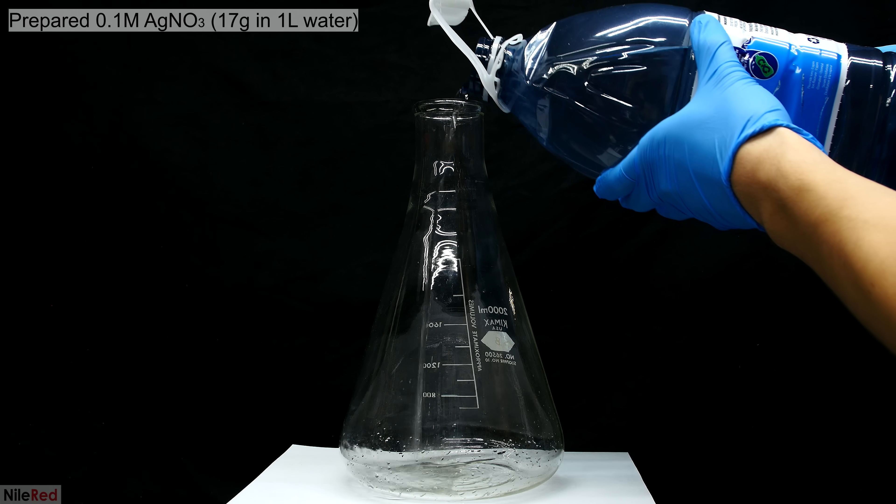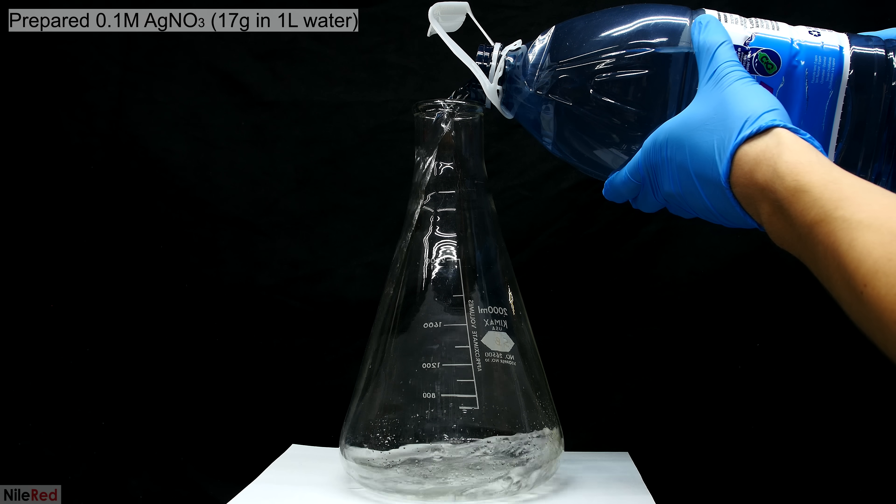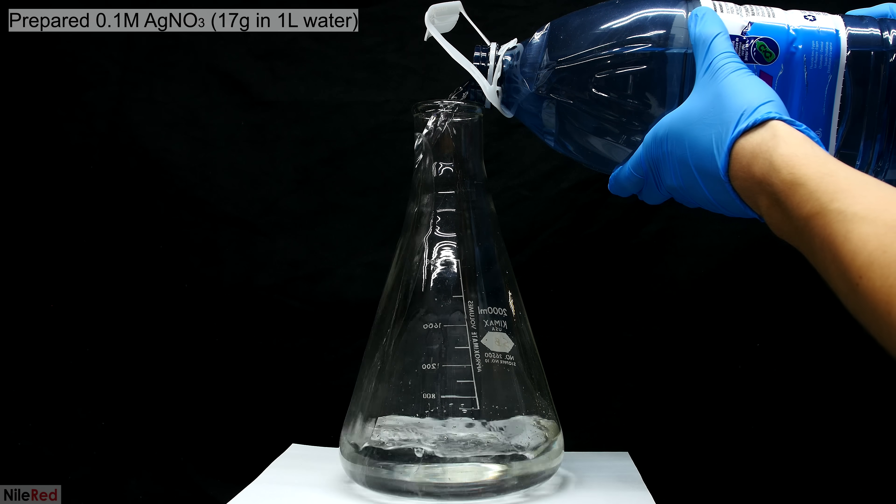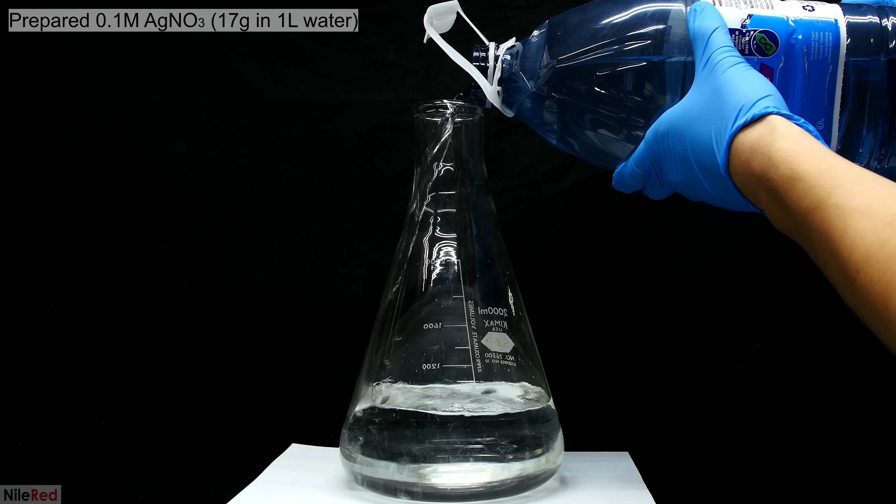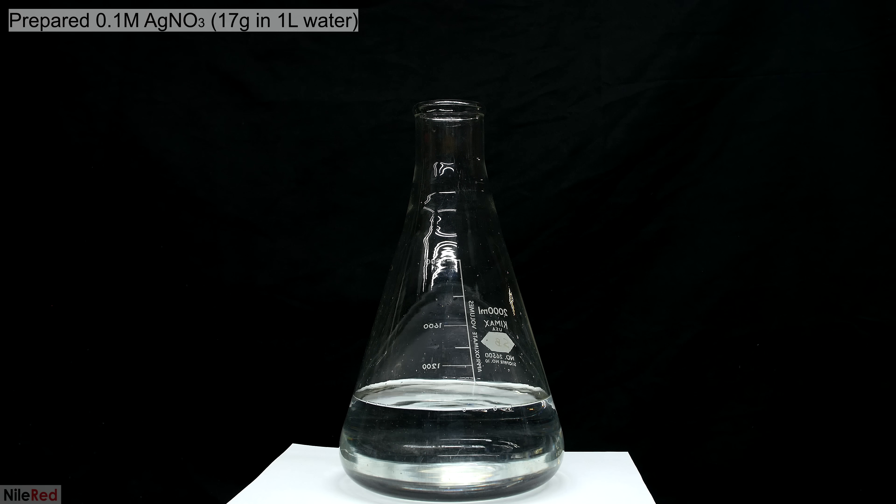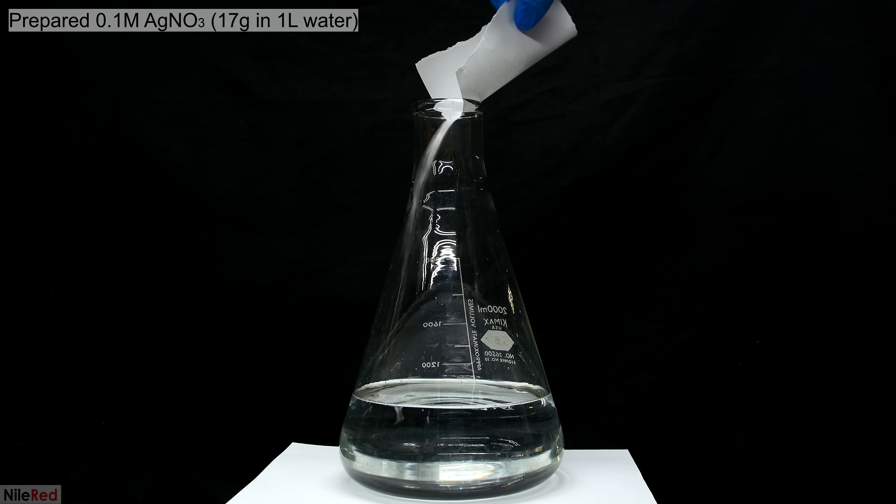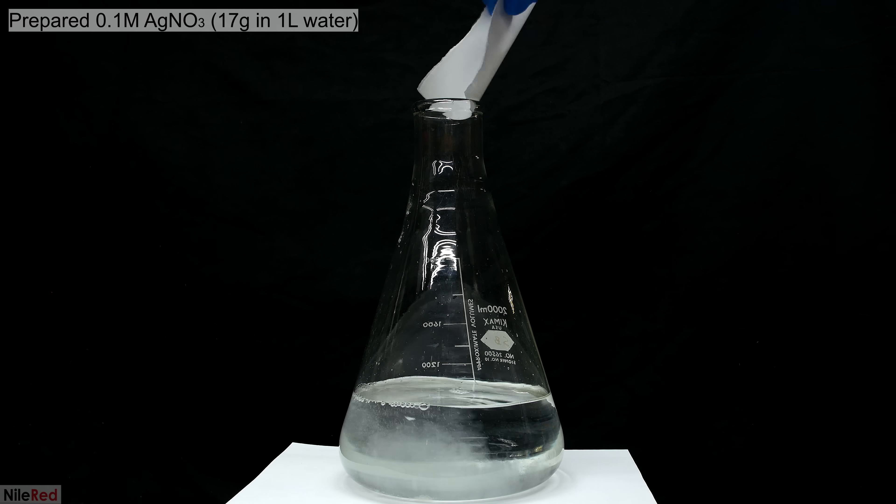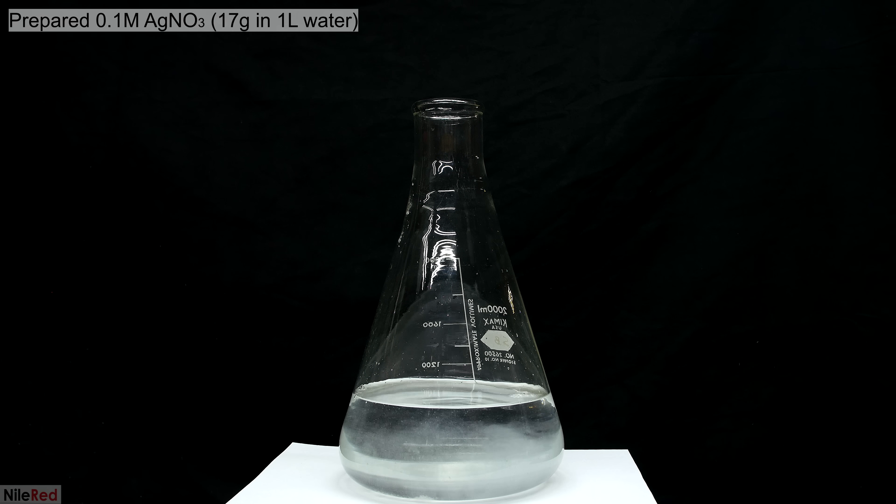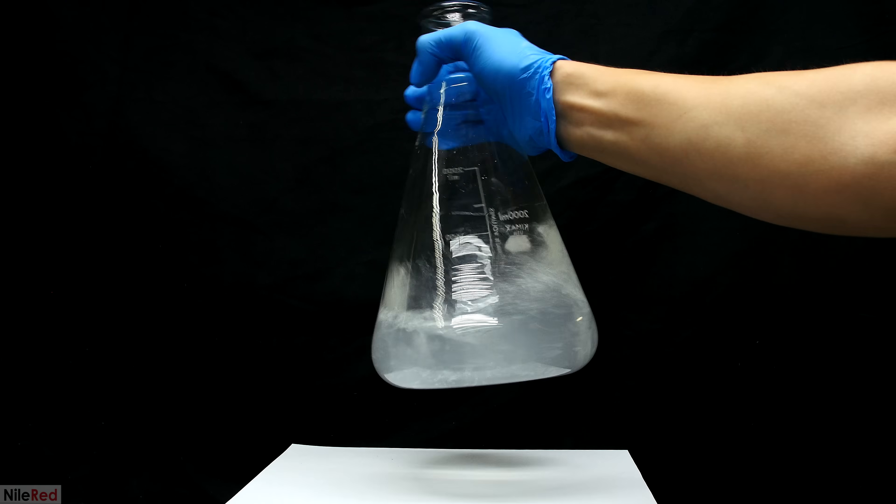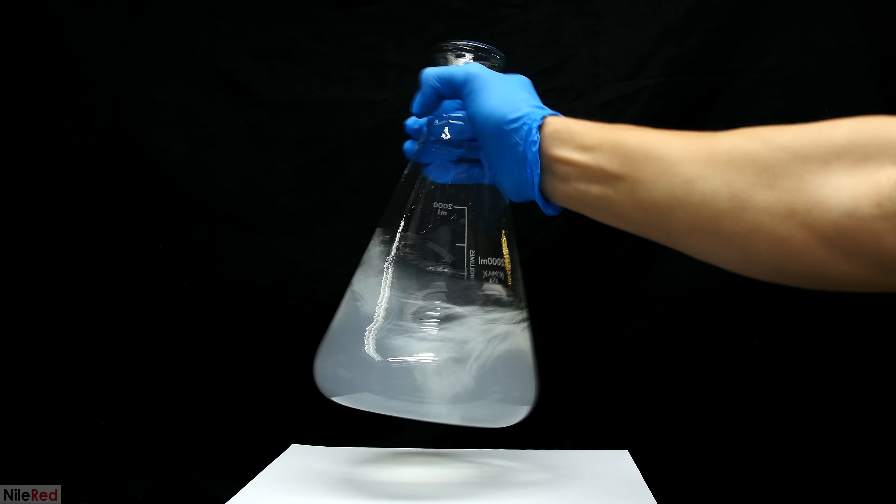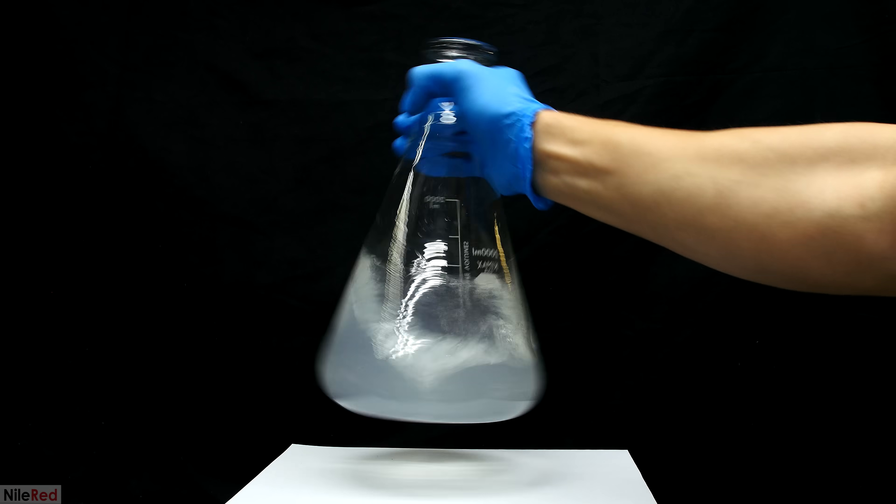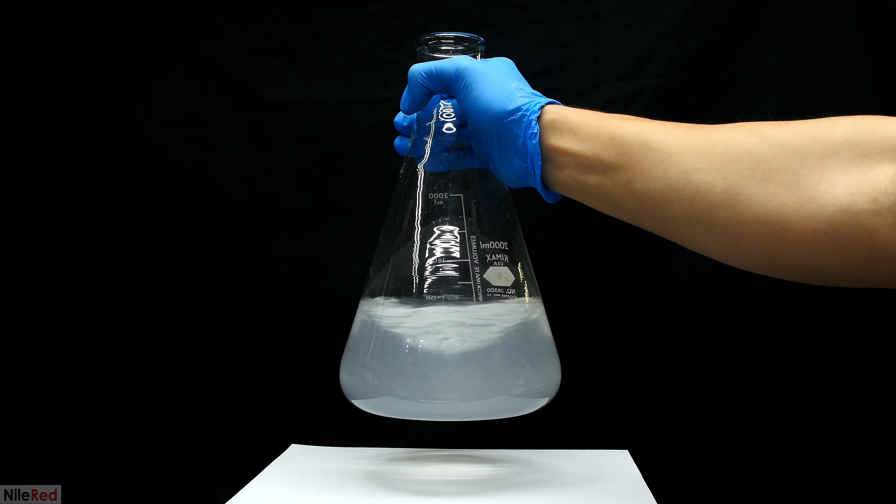The first thing that we need to do is make one liter of 0.1 molar silver nitrate solution. This just means we have 0.1 moles of silver nitrate dissolved in one liter of water. One mole of silver nitrate is about 170 grams, so 0.1 moles is about 17. I then manually mix it to get the silver nitrate to dissolve. Silver nitrate is very soluble in water, so after mixing for several seconds, it should all dissolve.